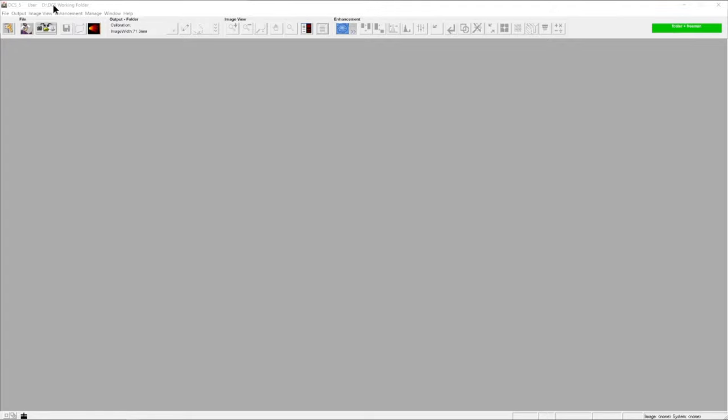Throughout the DCS5 software, there are various buttons and help points that we can use to help us with the photography or enhancement of finger mark images.